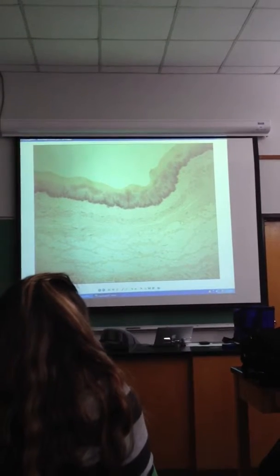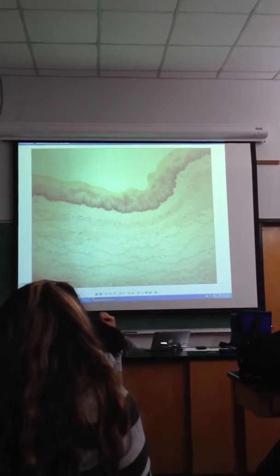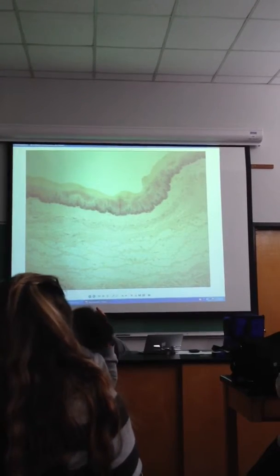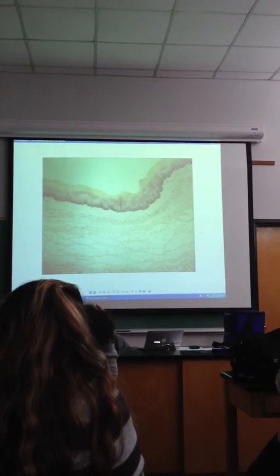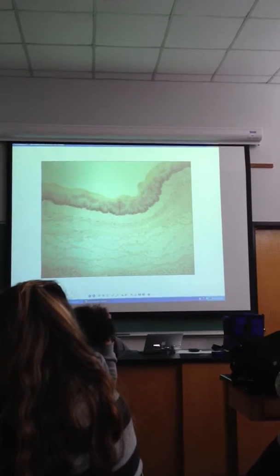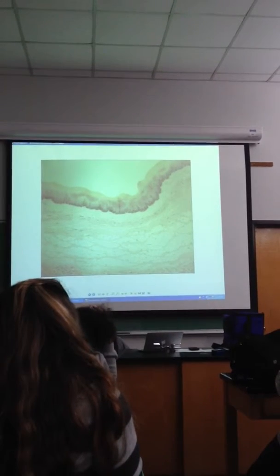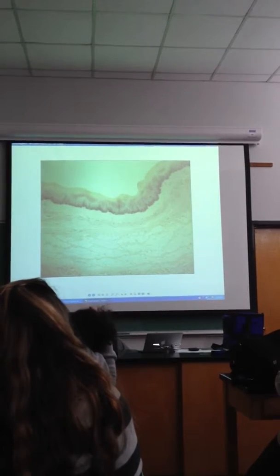But we've got the stratified squamous epithelium here, okay? That's going to make up the mucosa of the esophagus. If you look from here to here, there's the submucosa. You see a little adipose. Here at the very bottom, there's the beginning of the muscularis. Now, you don't have to identify those layers. I'm just telling you what they are, but nobody basically uses the submucosa and muscularis to identify these areas. What they will tell you to do is use the epithelial lining of the mucosa. And you've got it right there, stratified squamous.